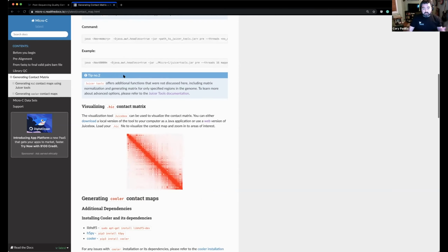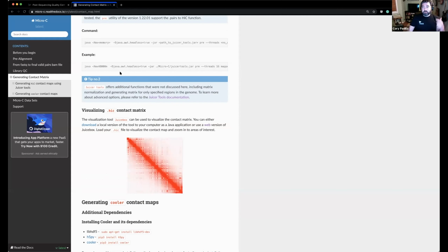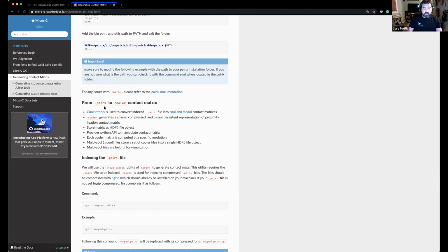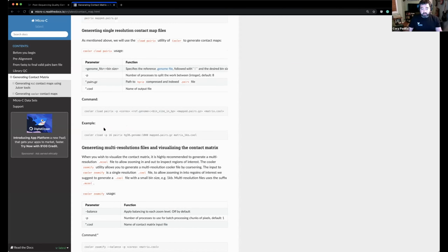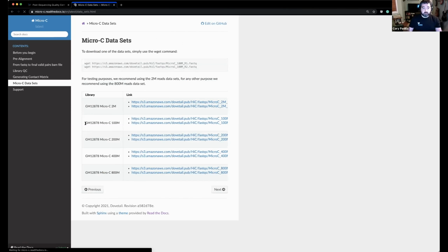So we've really taken our time here and broken this down step by step, so you can see exactly what output from each tool then feeds into the next input. So you really get a good sense of what your data is doing. We also have a workflow here for going from your pairs file into a .cool file with Cooler. Again, it's actually pretty straightforward to get going on this, so the learning curve is pretty shallow if you go this route.